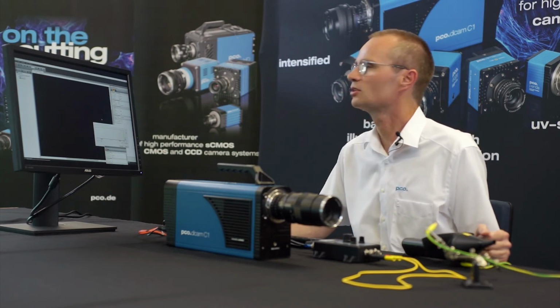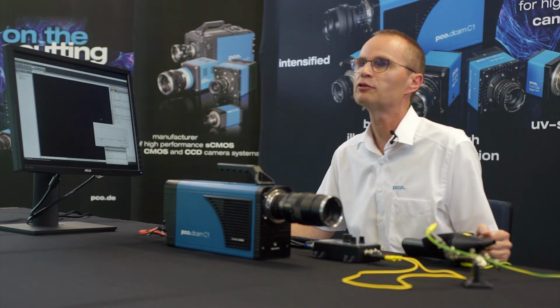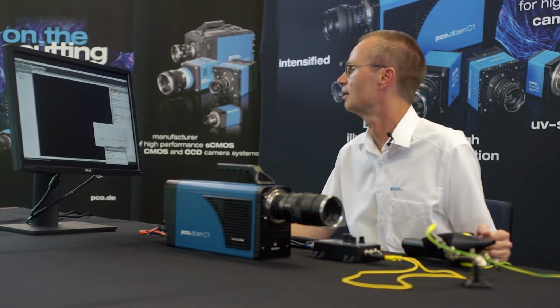The camera is configured to externally triggered image capture. I only have to press the record button to arm it.